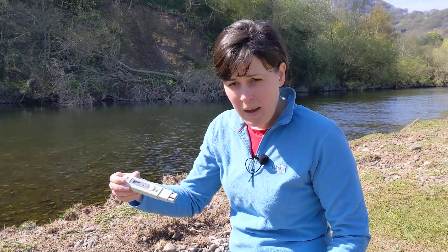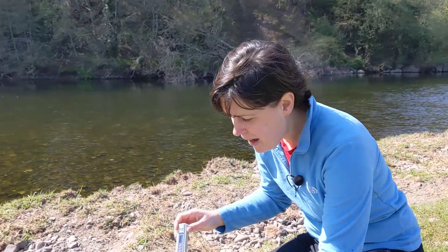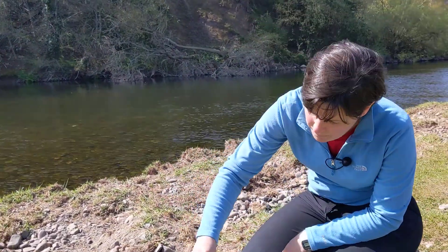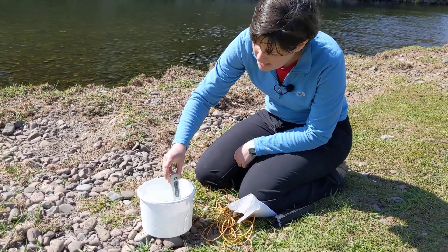Before you start, make sure your meter is dry and give it a little shake to make sure there's no other sample still clinging to the prongs. You may also wish to give it a little rinse. Then pop it into your sample, give it a little stir, and allow the reading to stabilize.